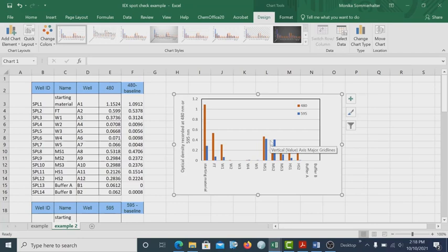We can just document the result in this graphical compact format and discuss some tendencies. We can also see from this presentation that after you injected the starting material into the column, the flow-through still had a lot of polyphenol oxidase activity and some protein escaped as well.